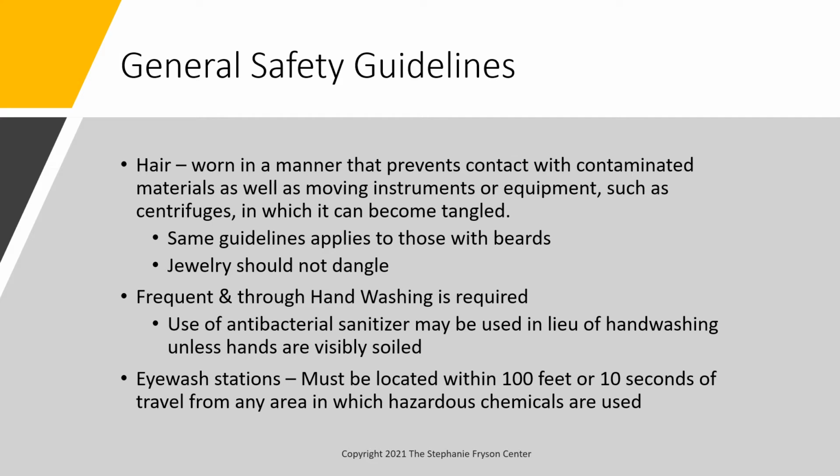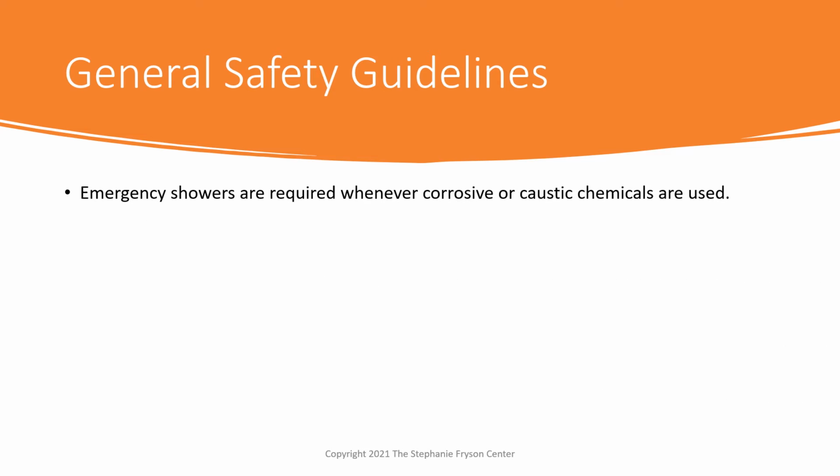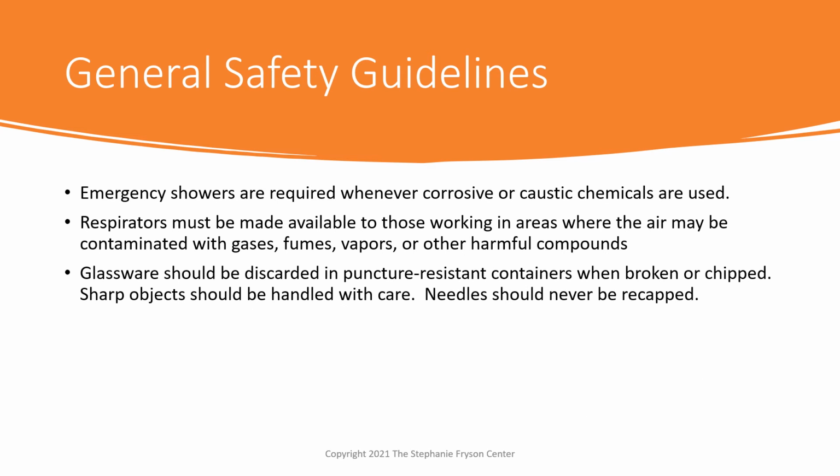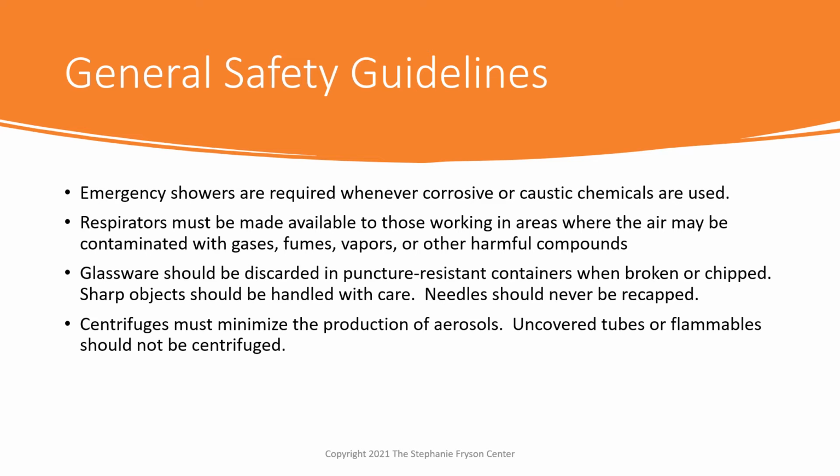There are eye wash stations that must be 100 feet or 10 seconds of travel from any area where hazardous chemicals are used. Emergency showers are required if there's corrosive or caustic chemicals. And respirators must be made available to those working in areas where the air may be contaminated with gases, fumes, vapors, or other harmful compounds. And glassware should be discarded in a puncture-resistant container when broken or chipped. Needles should never be recapped, and centrifuges have to minimize the production of aerosols. Uncovered tubes or flammables should not be centrifuged.